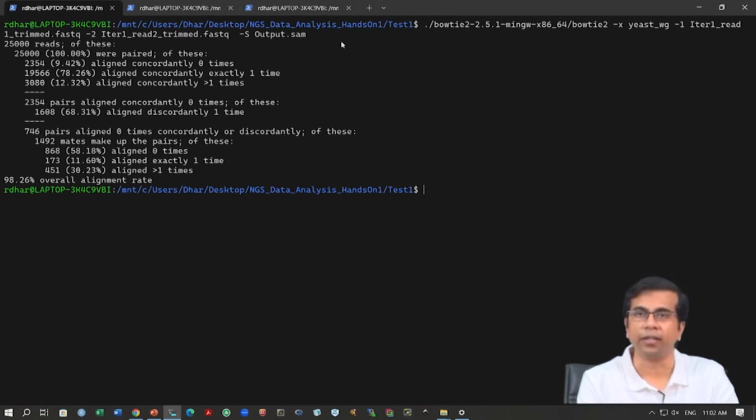As I mentioned, this output file is quite complex. There is a lot of data in there, and we need to understand how it is organized and what it means. If you want to process these SAM files for further analysis, you need to understand this format and the information stored inside. So, let us try different options. Once you run this, you get some summary statistics.